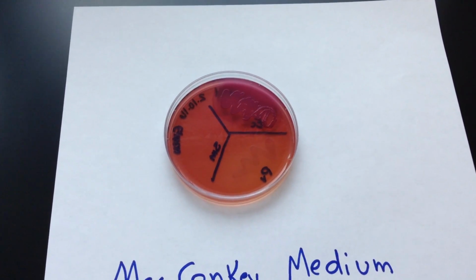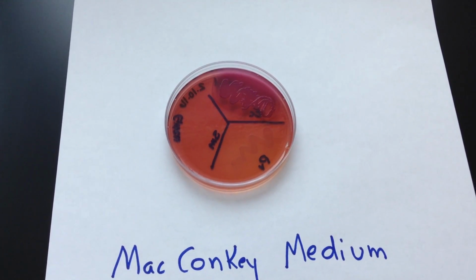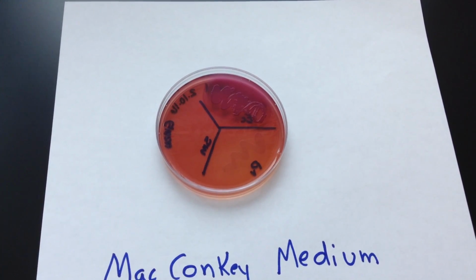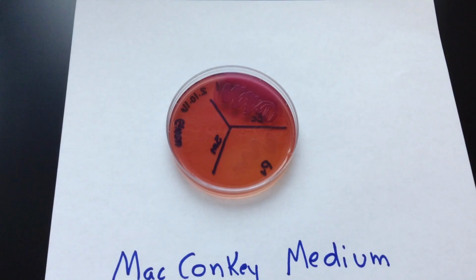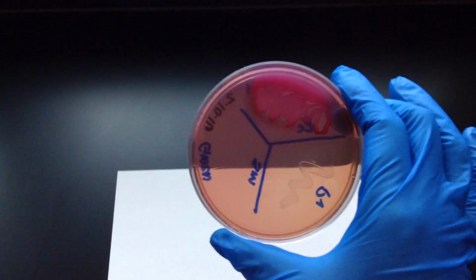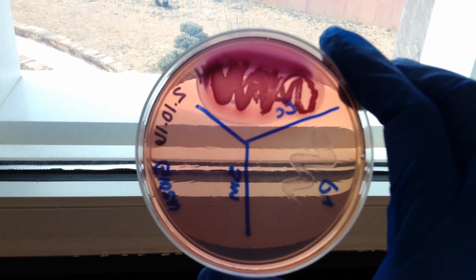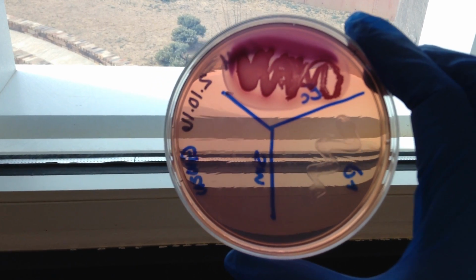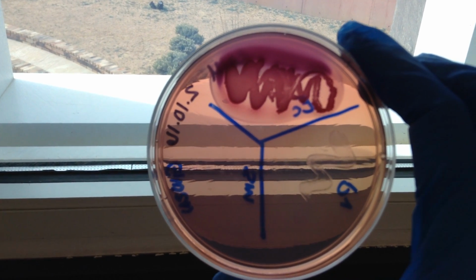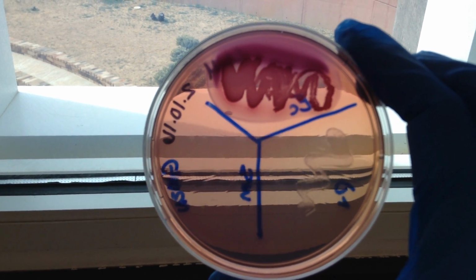So the organism first must be able to grow, and then we can say it's a gram-negative, and then we can determine whether it is an organism that has the enzyme lactase, which allows it to ferment lactose. Pay very close attention to those endings when you're describing the medium. Okay, so let's lift this up so we can get a little bit better look. Here we go. Okay, so here you can see at the very top is not only an organism that can grow on this medium, so now we know it's a gram-negative, but it can also ferment the disaccharide we talked about, lactose. And that means this particular organism has the lactase enzyme.